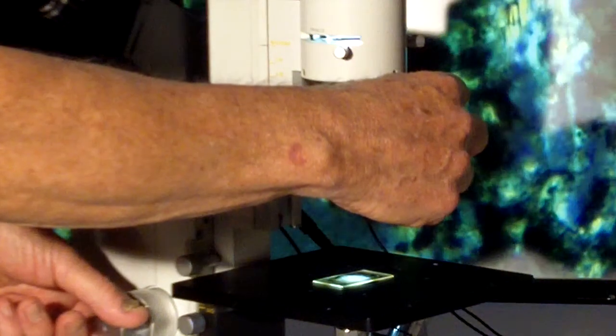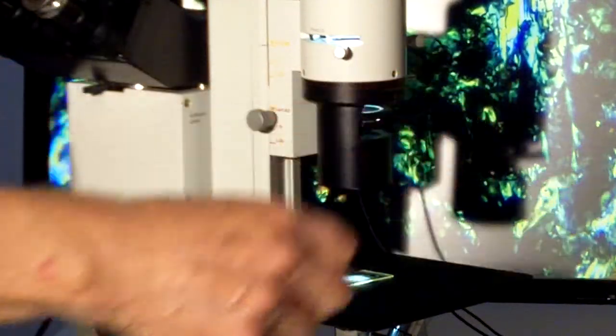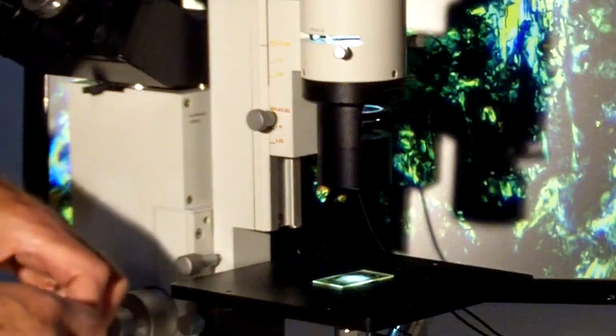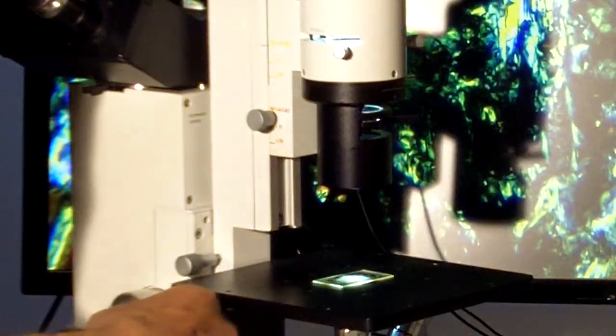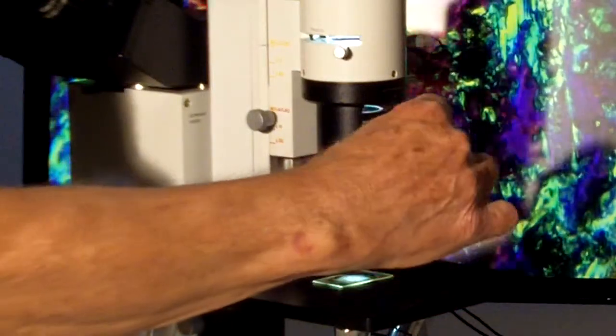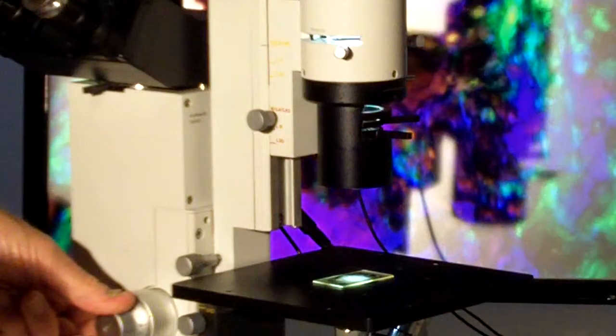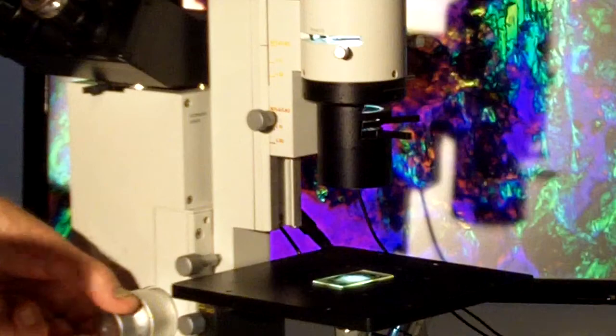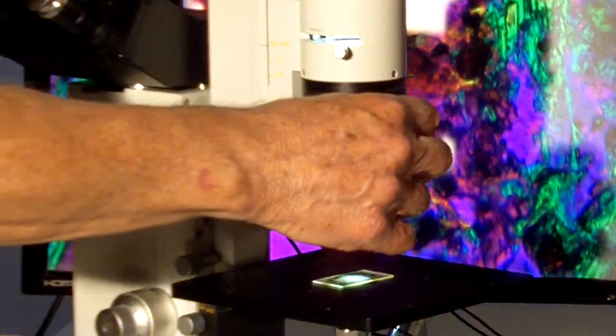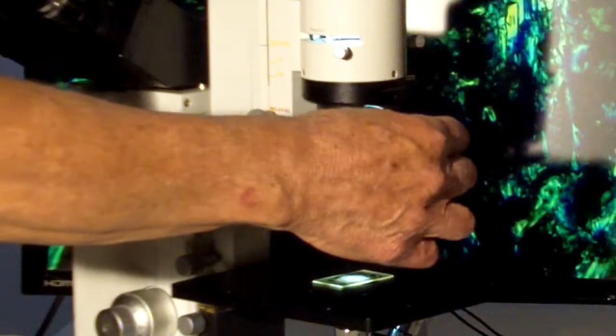We're using the same optics that we were using to look at things like diatoms and critters in pond water. The other component you can insert between the polarizer and the analyzer is a first order red compensator. Now everything that was black background becomes a beautiful magenta.